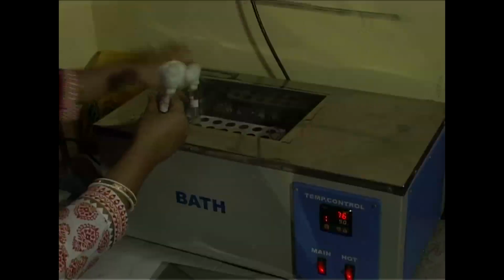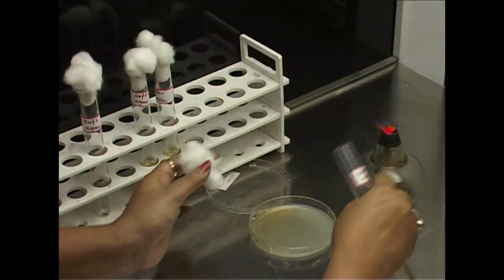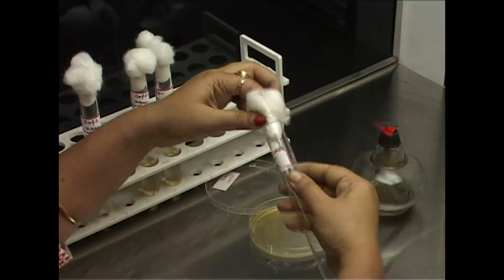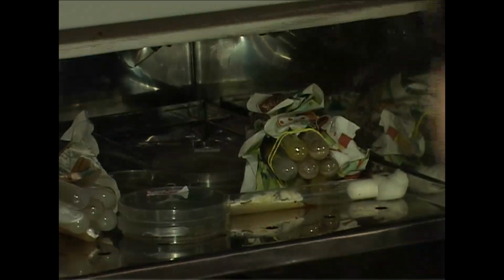It should not exceed 45 degrees centigrade or go below 40 degrees centigrade, because if the temperature exceeds 45 degrees centigrade, then the host cells may die, and if it is below 40 degrees centigrade, then the soft agar will solidify. So, maintain the soft agar temperature at 42 degrees centigrade by keeping it in a water bath. The mixture of host phage with soft agar is poured immediately onto the respective hard agar plates. Hard agar means the agar containing normal agar, that is 1.5 to 1.8%. As soon as the soft agar is solidified, the plates are incubated at 37 degrees centigrade in an inverted fashion.